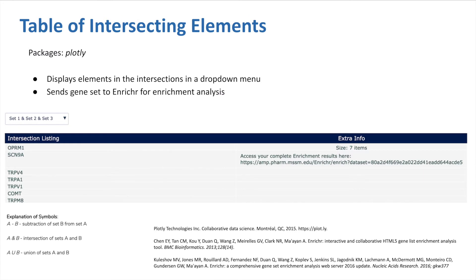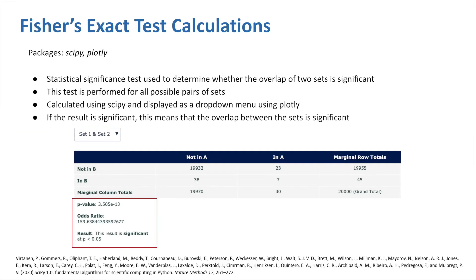The various elements of the intersection can be seen by using the options in the drop-down menu. We can see the cardinality of the intersections is displayed, as well as a link to Enrichr, which was created by the Ma'ayan Lab for enrichment analysis. Afterwards, Fisher's Exact Test is calculated. This is a statistical significance test to see whether the overlap of sets is significant. This test is computed for all possible pairs of sets and is displayed as a drop-down menu for the user to examine. We can see that the p-value, odds ratio, and result are produced.